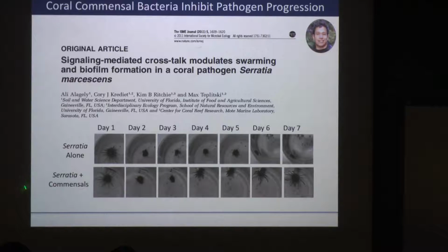And then in the second treatment here, we first inoculated our commensal strain. So this is a cocktail of 6 of our beneficial bacteria, allowed them to establish on the surface of the anemones overnight. And we did this at a sublethal concentration, I think it was about 10 to the 6 cells per mL. Allowed them to establish, and then subsequently infected with our pathogen at our LD50, and then asked if we would get the same level of infection and mortality.